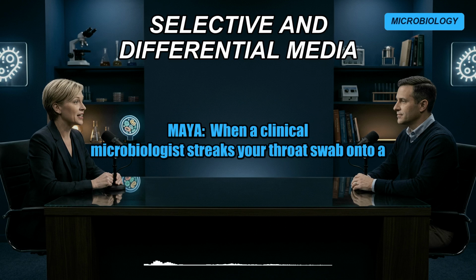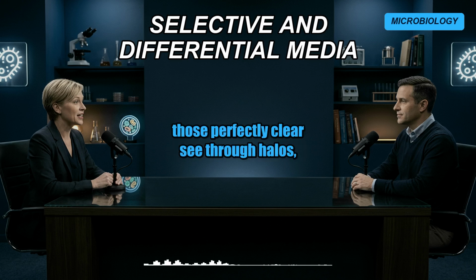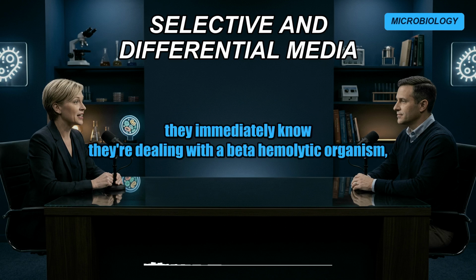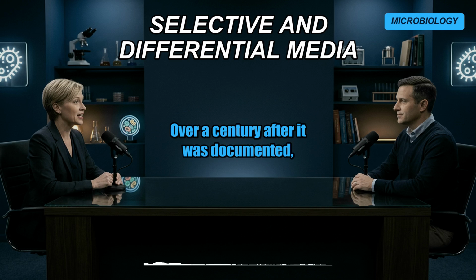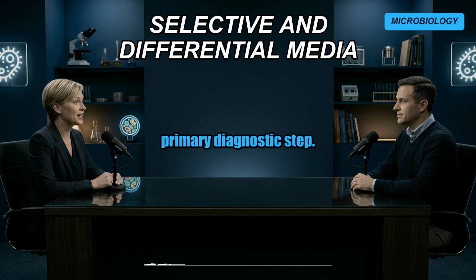microbiologist streaks your throat swab onto a blood agar plate, they incubate it overnight. If they pull it out the next morning and see those perfectly clear, see-through halos, they immediately know they're dealing with a beta hemolytic organism, most likely Streptococcus pyogenes, the culprit behind strep throat. Over a century after it was documented, holding that plate up to the light is still a primary diagnostic step.